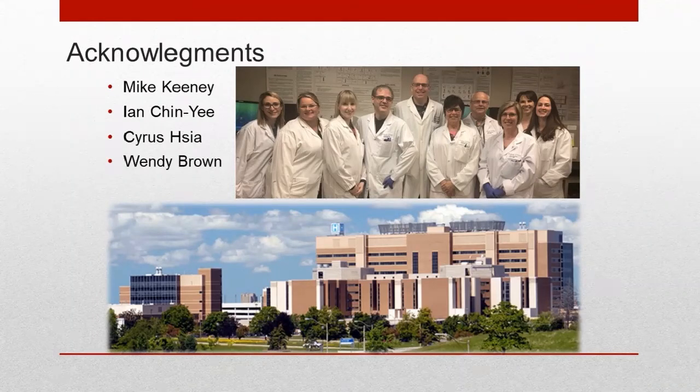If you're looking at a bone marrow, you can stitch all the tubes together, and it allows you to see how your tubes are performing against each other. We do a similar thing with some of our tubes as well. So it's a very useful way to anchor your patient between tubes. That's why it's in there.